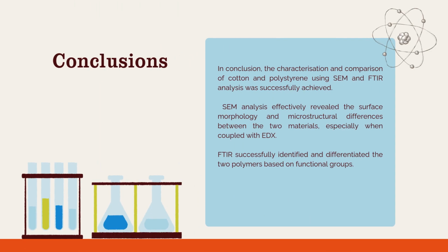In conclusion, the characterization and comparison of cotton and polystyrene using SEM and FTIR analysis was successfully achieved. SEM analysis effectively revealed the surface morphology and microstructural differences between the two materials, especially when coupled with EDX. FTIR successfully identified and differentiated the two polymers based on functional groups.